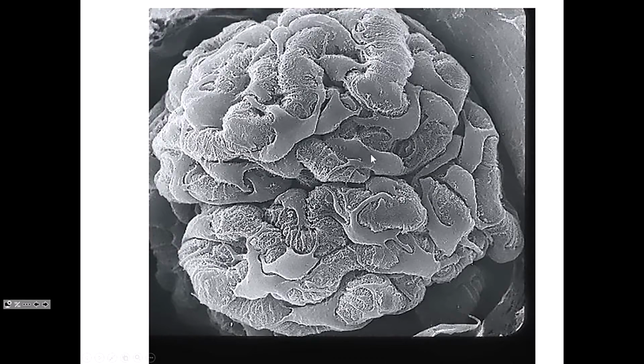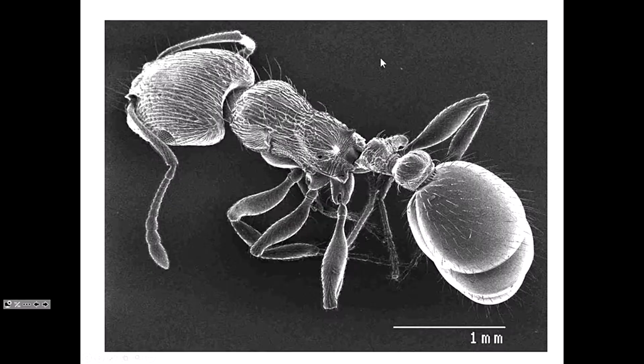You can see this is obviously different to that, so this is a different cell type to this component of the glomerulus. Or we can do something like this. So we know what this is, right? It's an ant, okay? And we can see the very fine detail, like look at these hairs on the surface of the ant. So here's his head, antenna, thorax, abdomen, and 6 legs, okay?